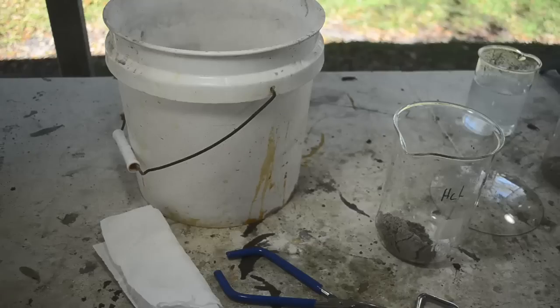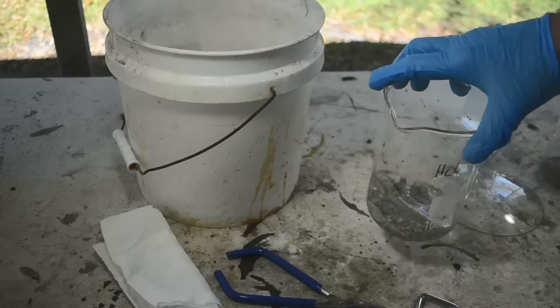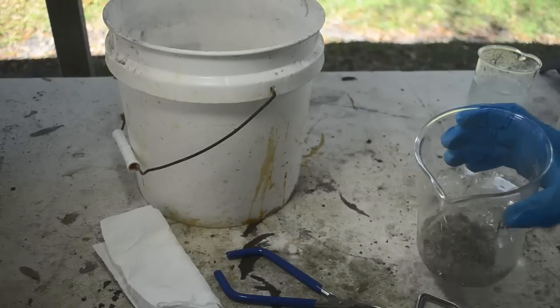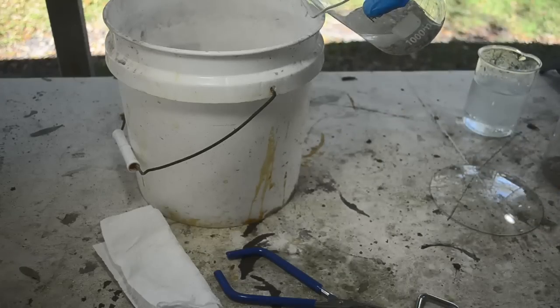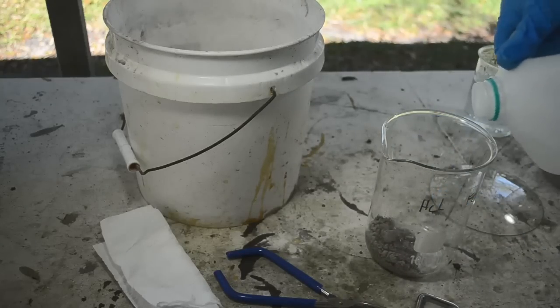So I'm going to give both of these some rinses. Distilled water. And I will continue rinsing them until they come out pH 7, which is basically neutral. Then I'll know I've got all the acid off of them. So that'll probably take a few rinses, even though I use dilute acid. They've already given that kind of a rinse, so I will concentrate on this one for now.